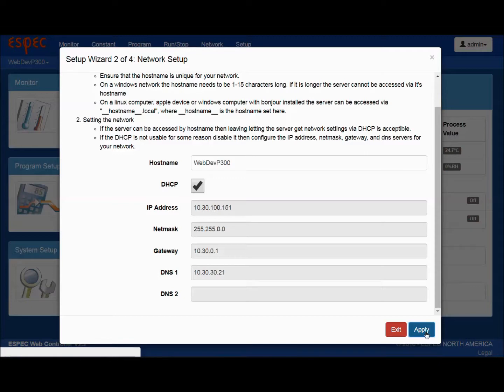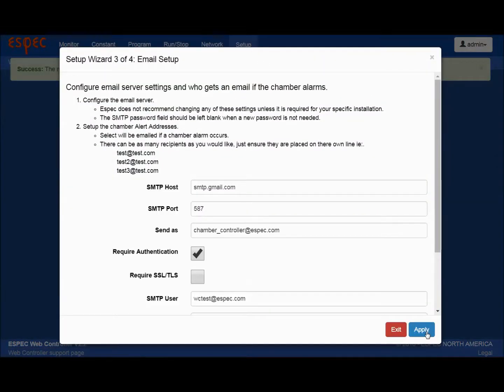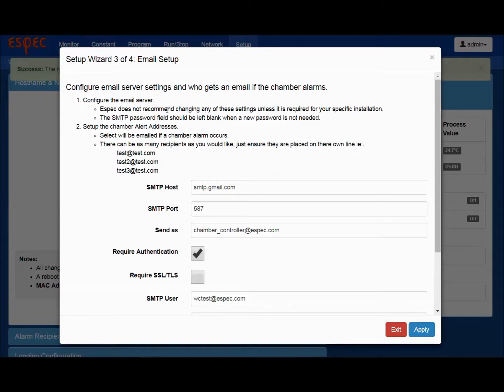The third section sets up your email addresses and notifications. This allows emails to be sent for any chamber alarms and alerts, so you'll know when temperature or humidity changes occur or tests are complete.